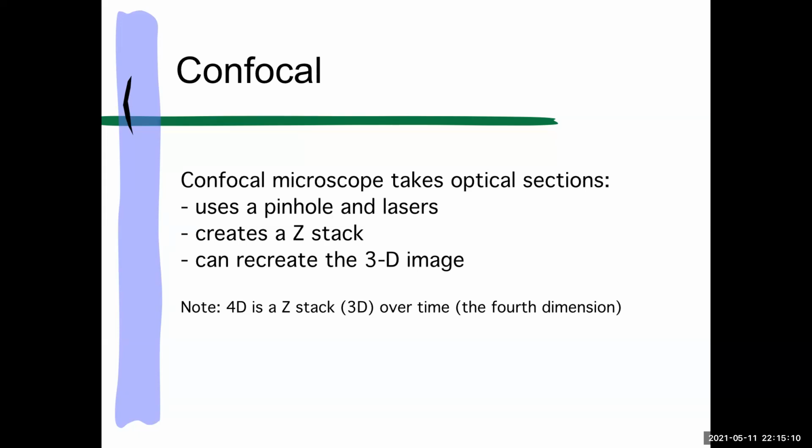And what you get in the end is called a Z-stack. So it's a series of images that are located on top of each other. Basically, as you went through your specimen, you've created this stack of images.